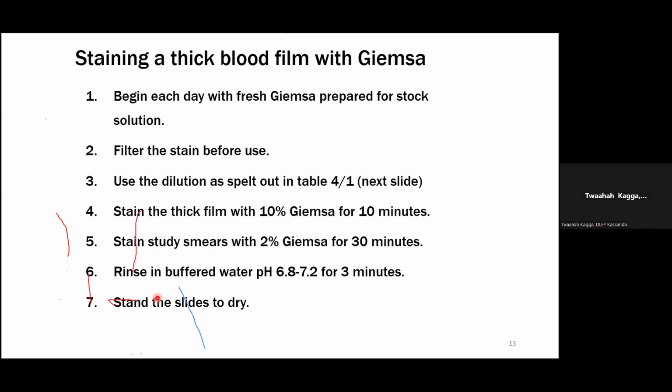For this presentation, I put here the staining procedure for Giemsa stain, one of the common stains we have.